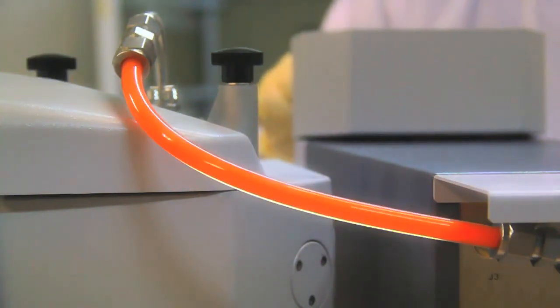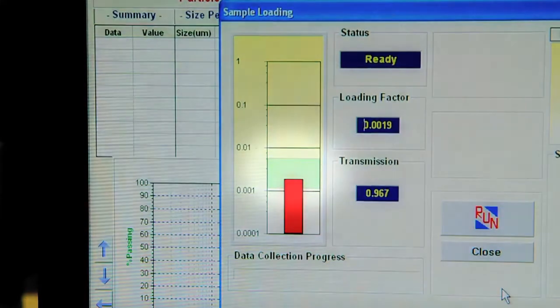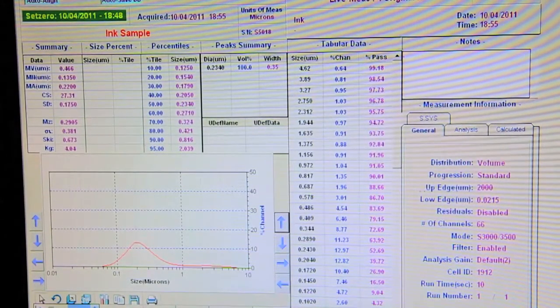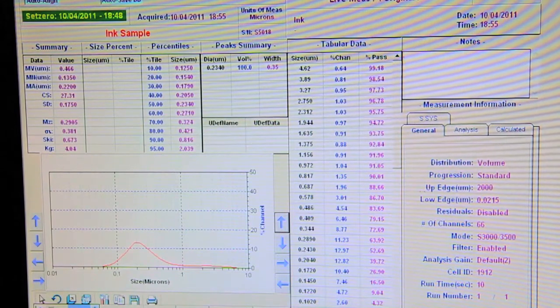The sample is added to the SDC until the red loading bar reaches the green zone, as indicated on the software. The sample data is displayed on the FLEX software and is automatically saved into the database.